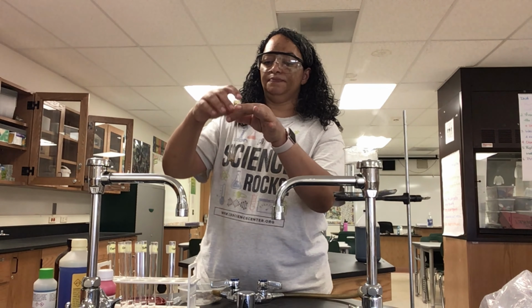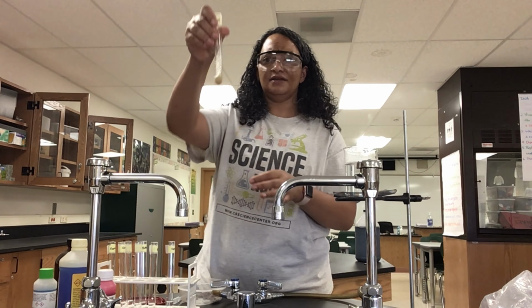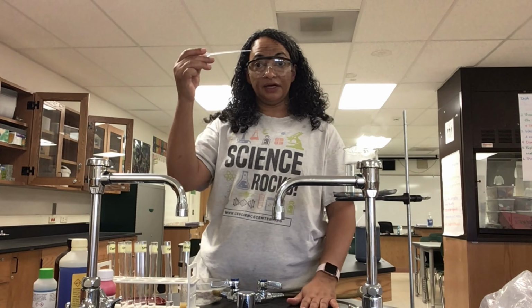So I'm going to throw it in there, and then I'm going to swirl it around a little bit so it's nice and mixed up. Oh yeah, doesn't that look delicious? All right, I'm going to take my pipetter.